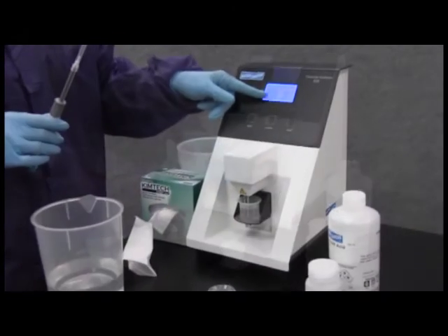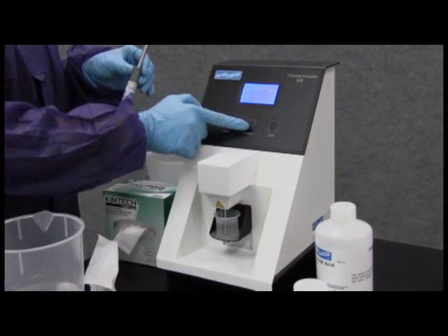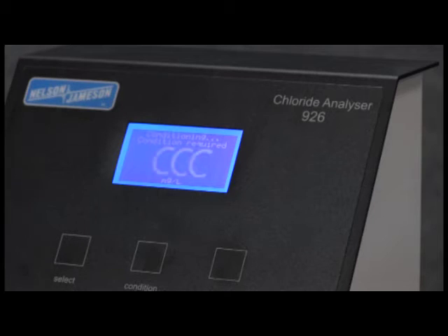With the analyzer in milligrams per liter mode, press the condition switch. CCC is displayed. The conditioning cycle will take one and a half to two minutes. The analyzer will stop automatically and display zero. Keep the cup raised.